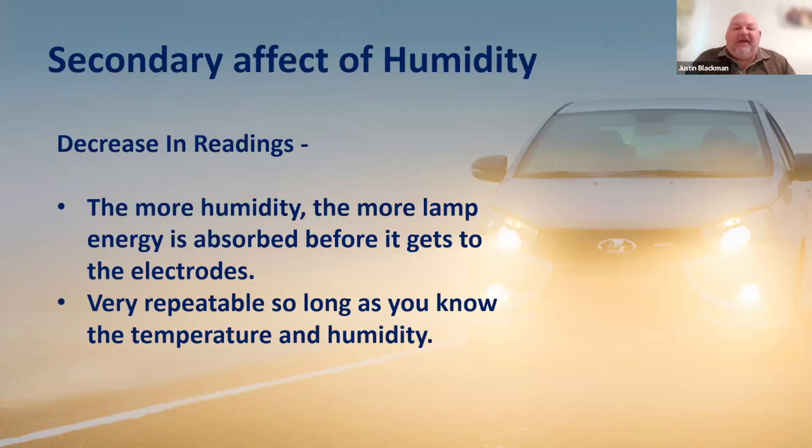And the graphic is trying to make us think of that as the energy headlights are fog lights. You have fog around, the fog will just absorb the light from our car headlights before it even has a chance to light up the road properly. That's our secondary effect going on there.